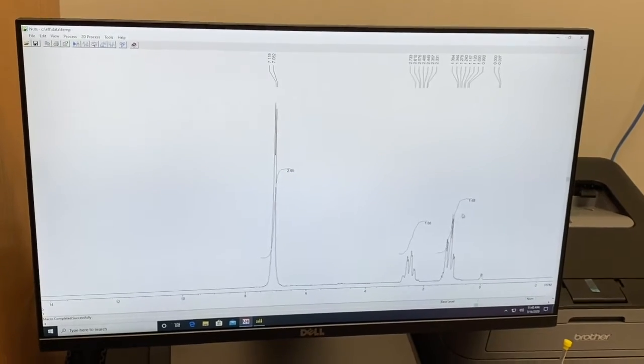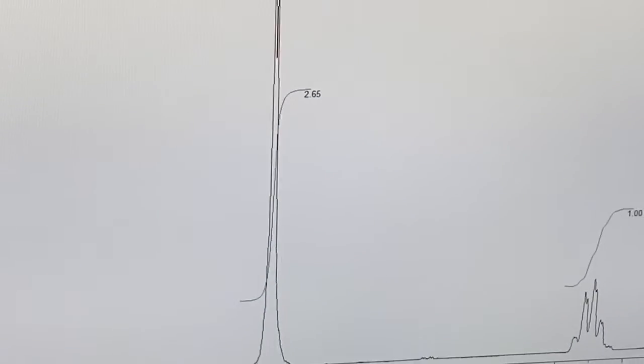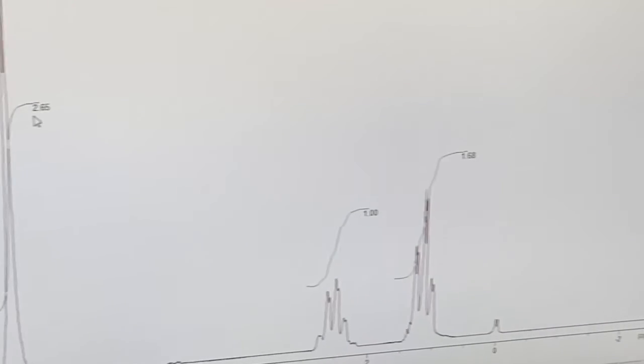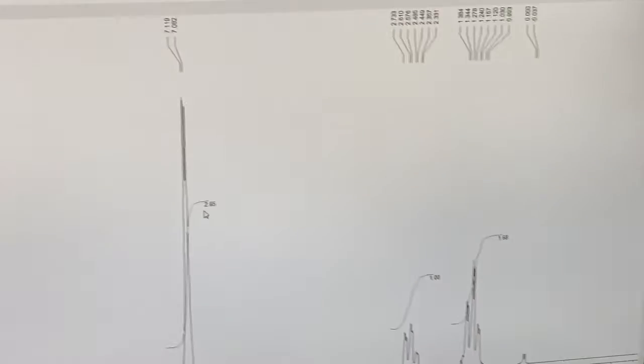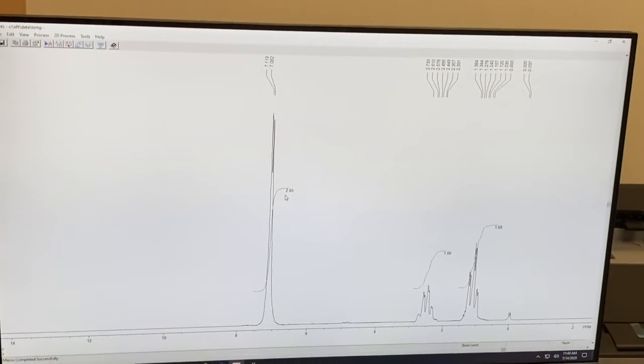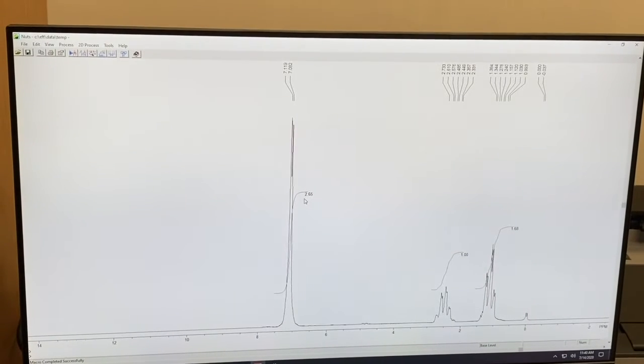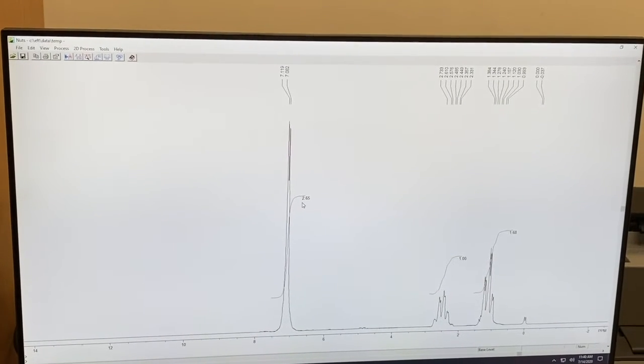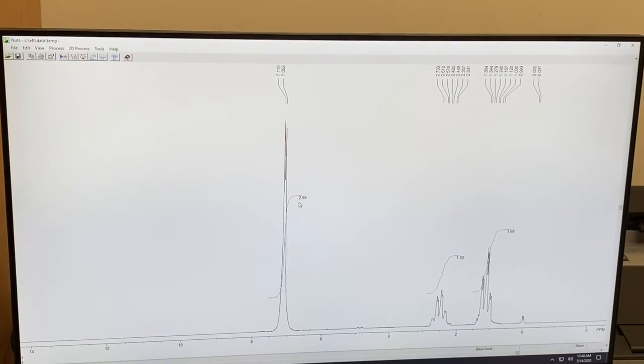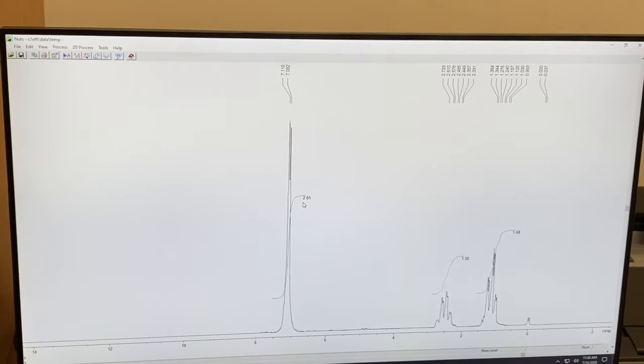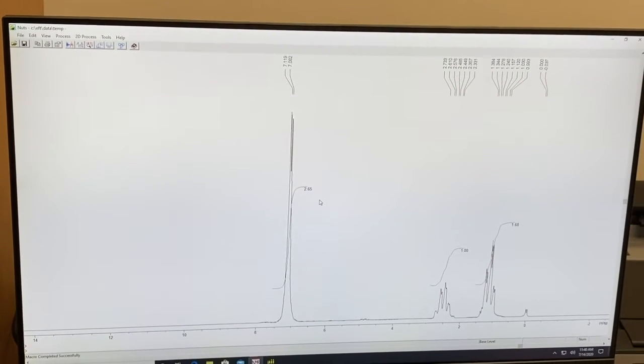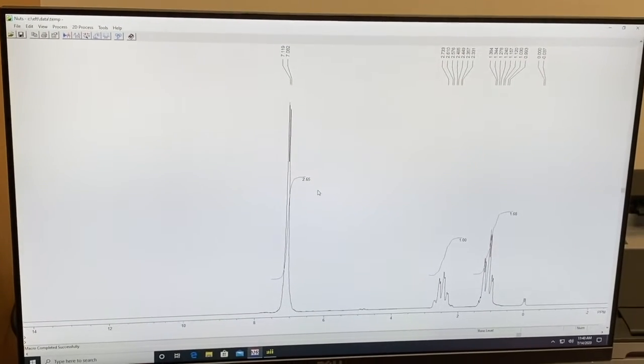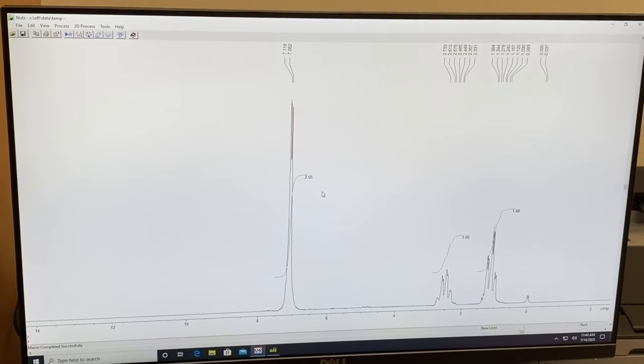You can see that each peak has its own broken integral associated with it. However, sometimes the instrument misses a peak. And so you need to know how to do the integrals on your own so that you make sure that every peak gets integrated. So let's say this is what the machine spits out.